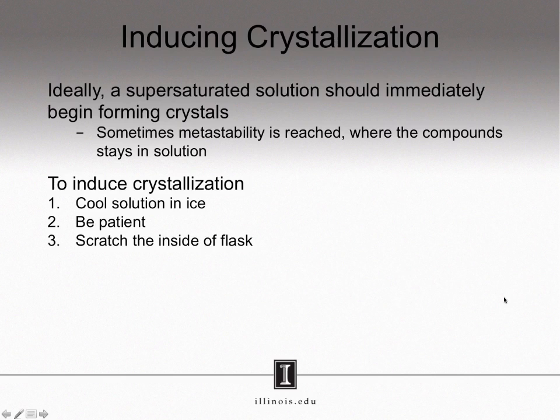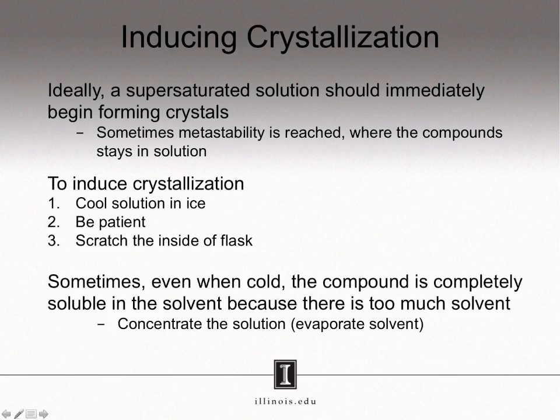If you have taken all of these actions and crystals still won't grow, then it is very likely you have used too much solvent. If you have used too much solvent, all of your compound may be soluble in the cold solvent. To try and fix this, you should concentrate your solution. To do this, you should evaporate some of your solvent. To prevent this situation from happening, when dissolving your impure solid in hot solvent, make sure you are using small volumes of hot solvent to begin with, with thorough swirling.